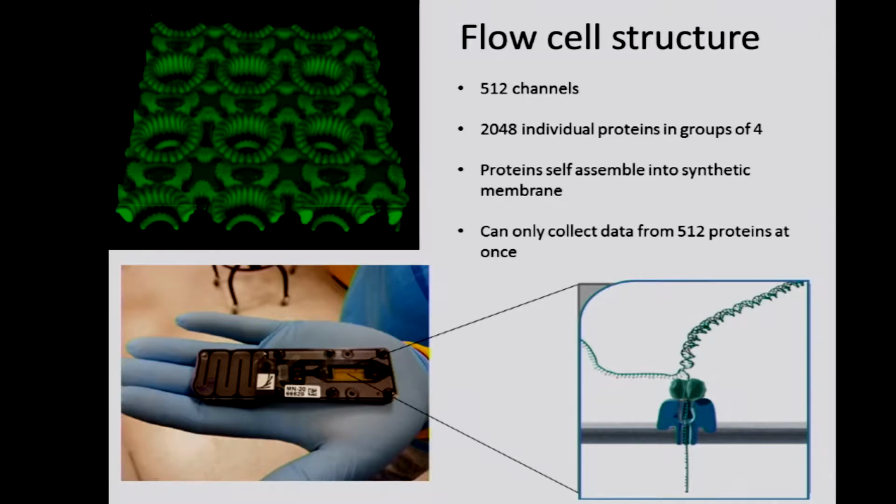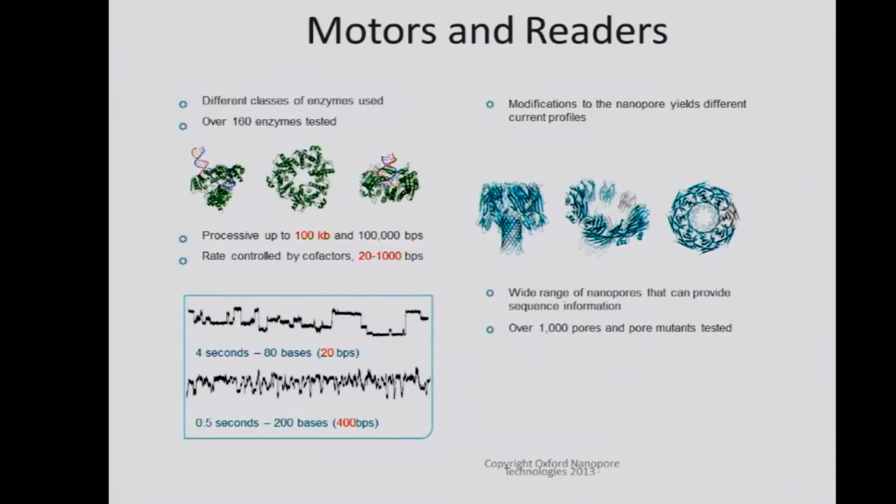All right, so within each of those dots, we have the little protein pore on there. Now, there are actually 2 proteins involved. I'll kind of touch on what those are shortly. When the DNA translocates through the pore, we measure the change in current. We have DNA sequencing. Proteins. Oxford Nanopore uses alpha hemolysin A. However, they did investigate many hundreds of proteins for use in this system, including MspA, other proteins I don't necessarily know, mutant versions of these proteins, and this is what they have settled on for their current approach.